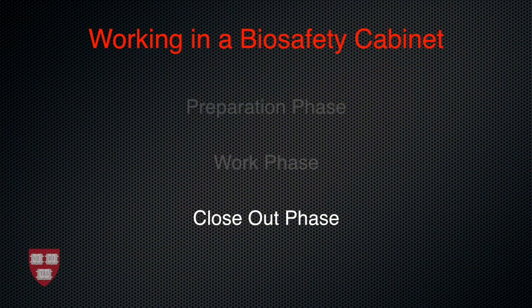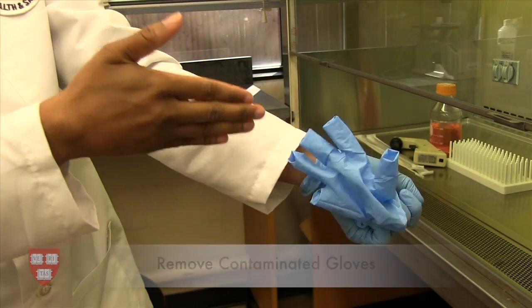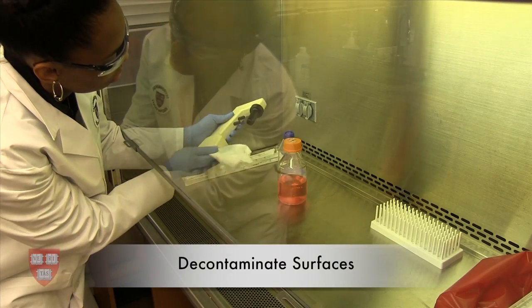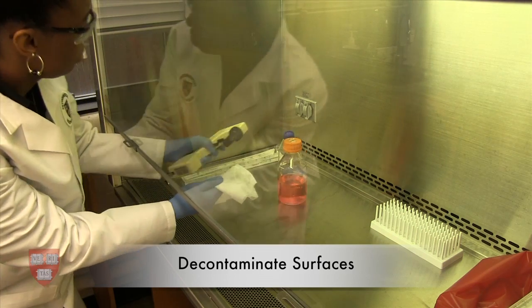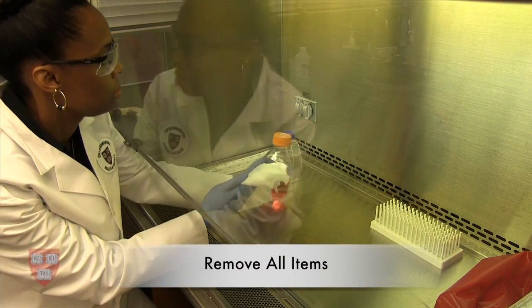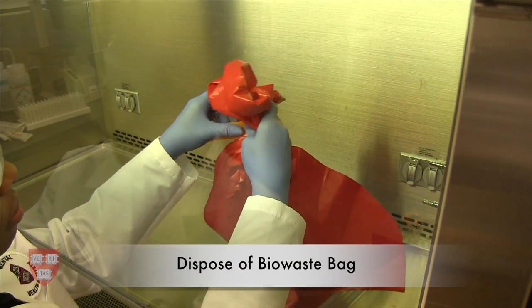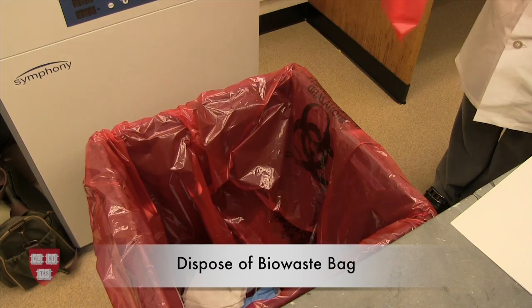Once the work is complete, you will need to return the cabinet to its initial clean and empty state. This is the closeout phase. First, remove contaminated gloves and put on a clean pair. Decontaminate the surface of all containers and equipment before removing them from the cabinet. Nothing should be left or stored in the biosafety cabinet after completion of work. Close off your bio waste bag and place it into the bio waste stream.